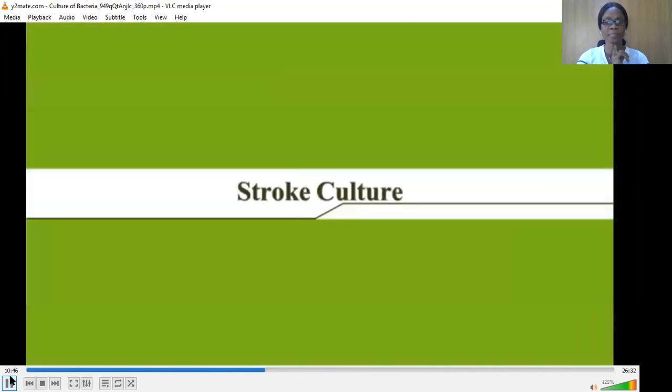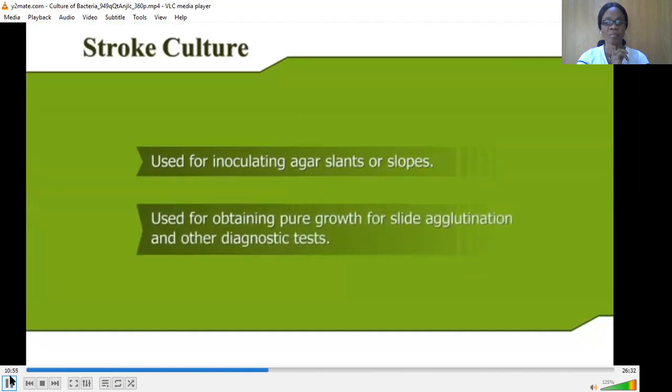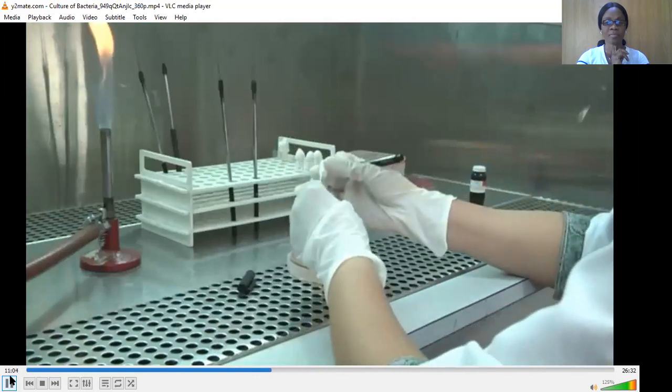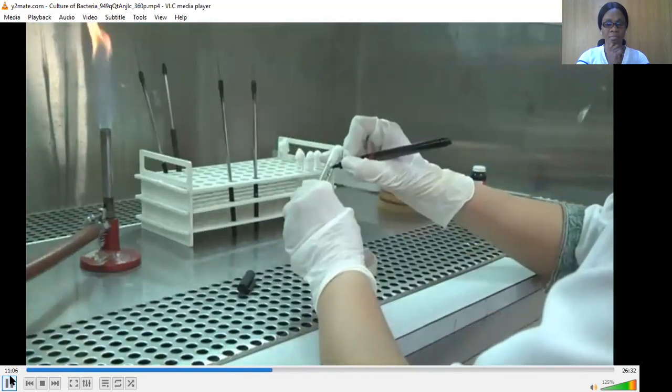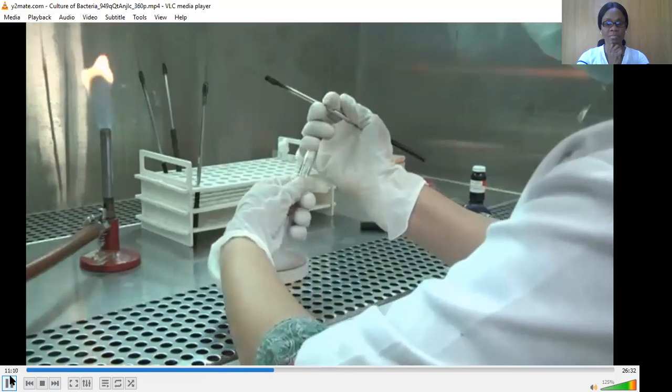Stroke culture. This method is generally used for inoculating agar slants or slopes. It is used for obtaining pure growth for slide agglutination and other diagnostic tests. Take a tube or a bottle with an agar slant medium and label it before inoculating. Loosen the cotton plug or cap.